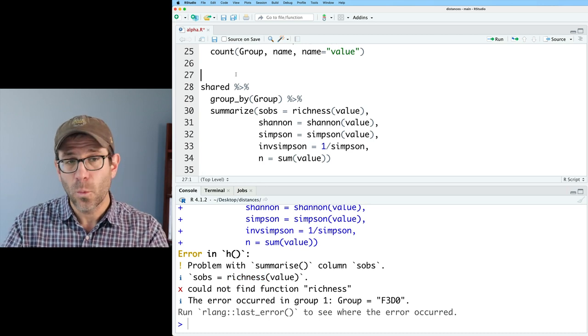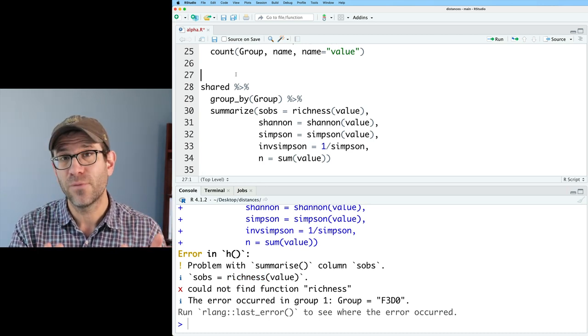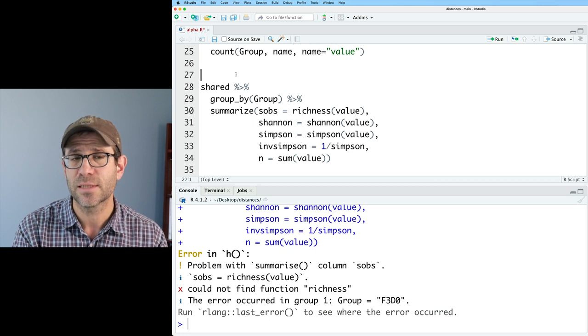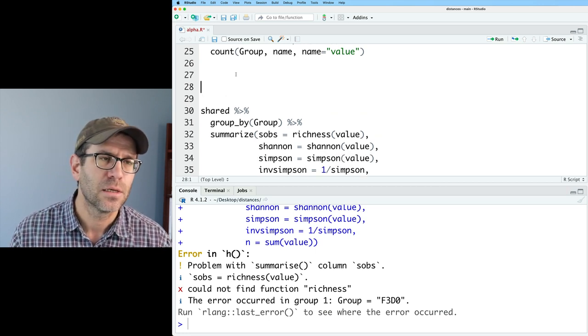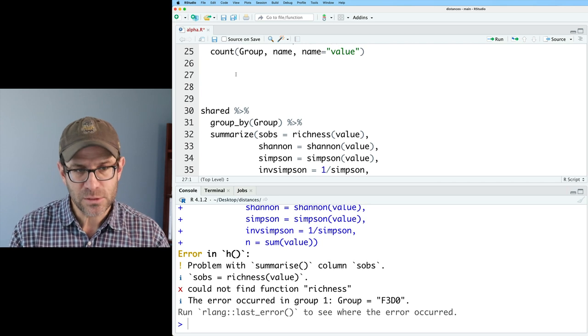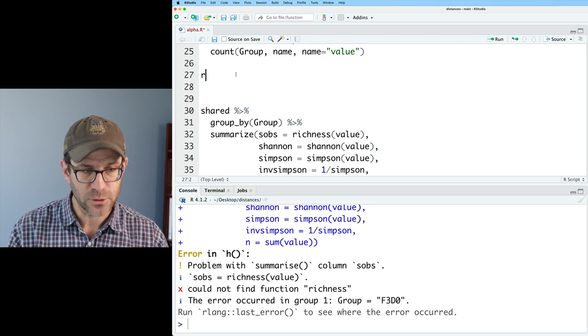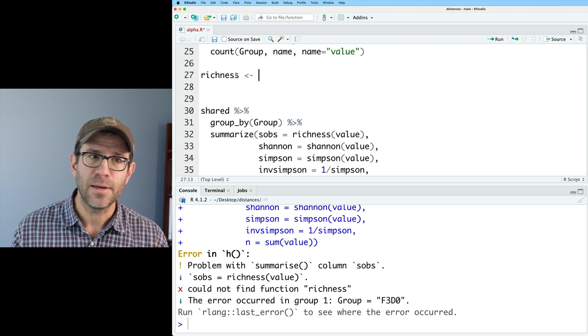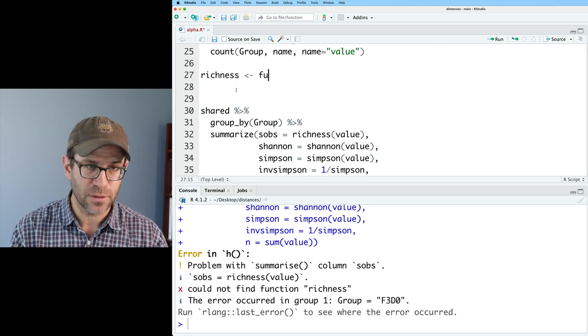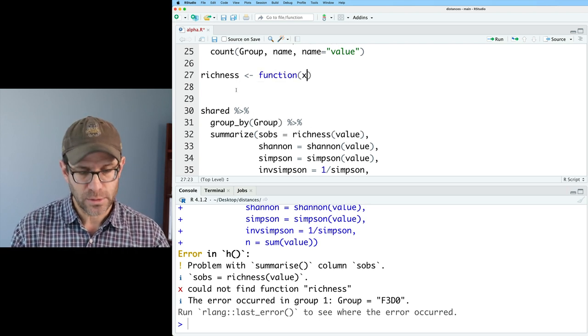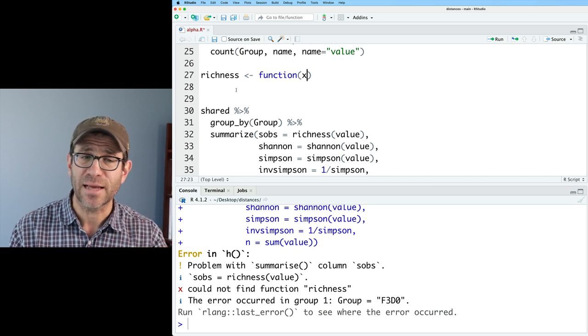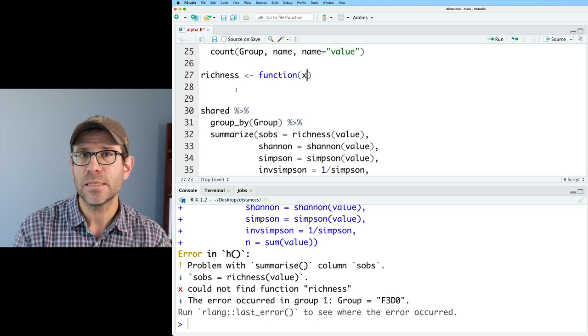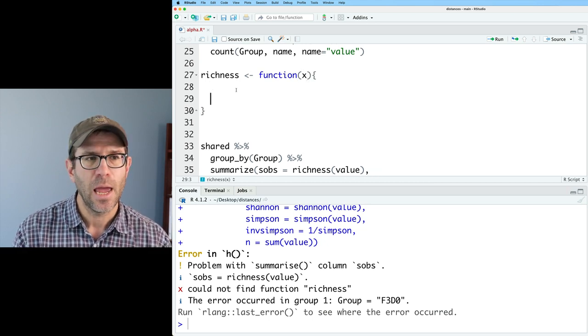So we are going to write three functions to calculate the richness, the Shannon diversity index, and the Simpson diversity index. We start with the name of the function. I'll say richness, and then the assignment arrow, because we're now going to take the function keyword. And we're going to have one parameter, which is going to be x, which is the counts. So we're going to pass in that value column into this richness function.